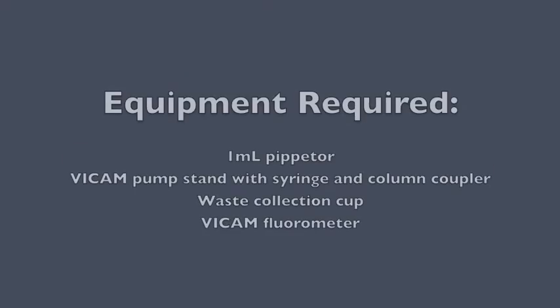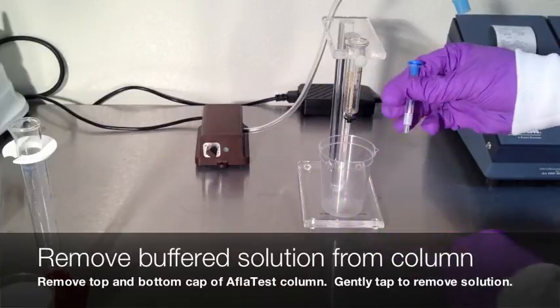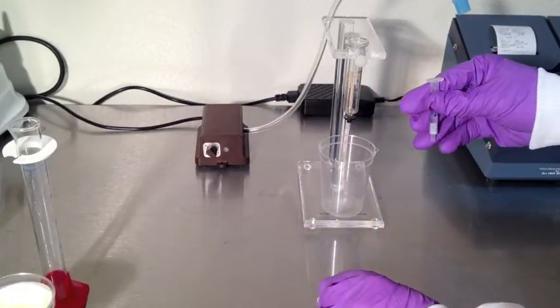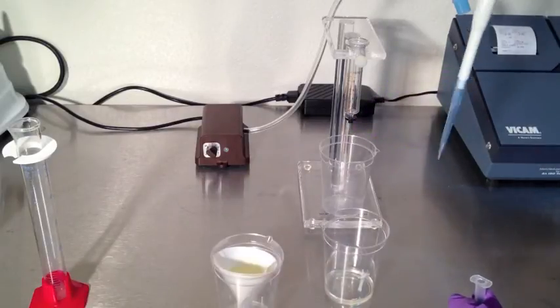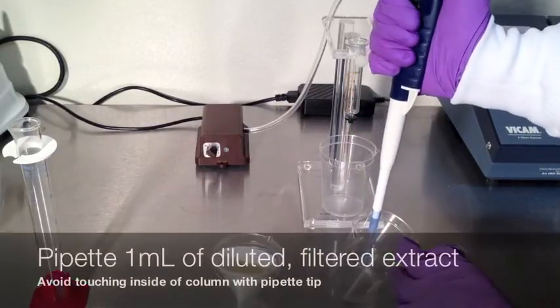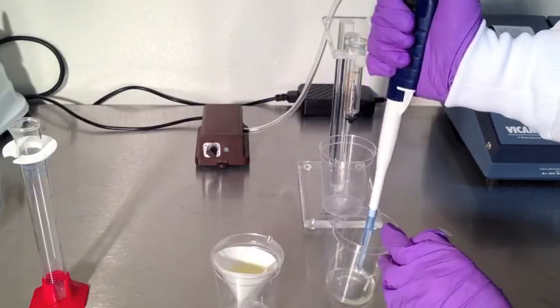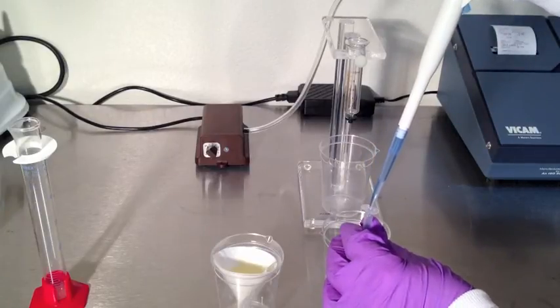The final step requires a 1 milliliter pipetter, a Vicam pump stand with syringe and column coupler, a waste collection cup, and the Vicam fluorometer. Remove the top and bottom cap from an Aflitest test column and gently tap to remove the buffered solution from the column. Pipet 1 milliliter of diluted filtered extract directly into the top of the Aflitest column head. Avoid touching the edge of the column.